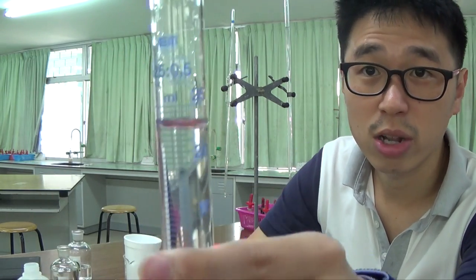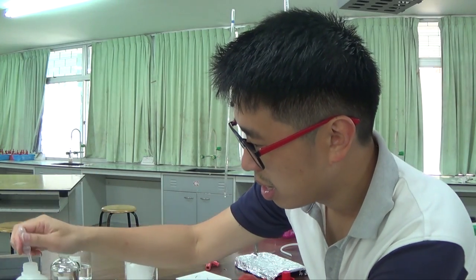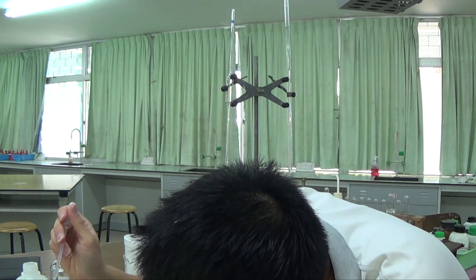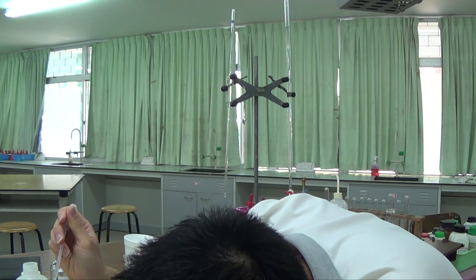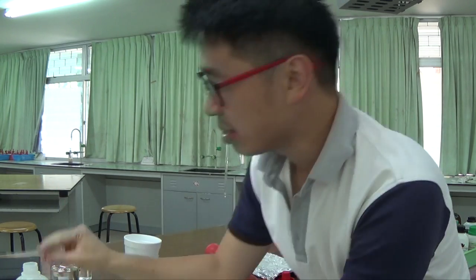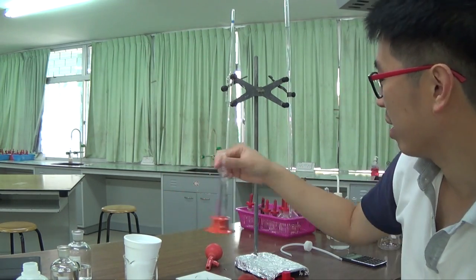So I'm very close to 25 now. I'm going to use my dropping pipette and try to get 25. Ideally, I'll do it on level ground, because when you hold something, your hands might be shaking. And I want to be reading below the meniscus. But to be honest, as I said earlier, this is a measuring cylinder, so how accurate can it be, okay?